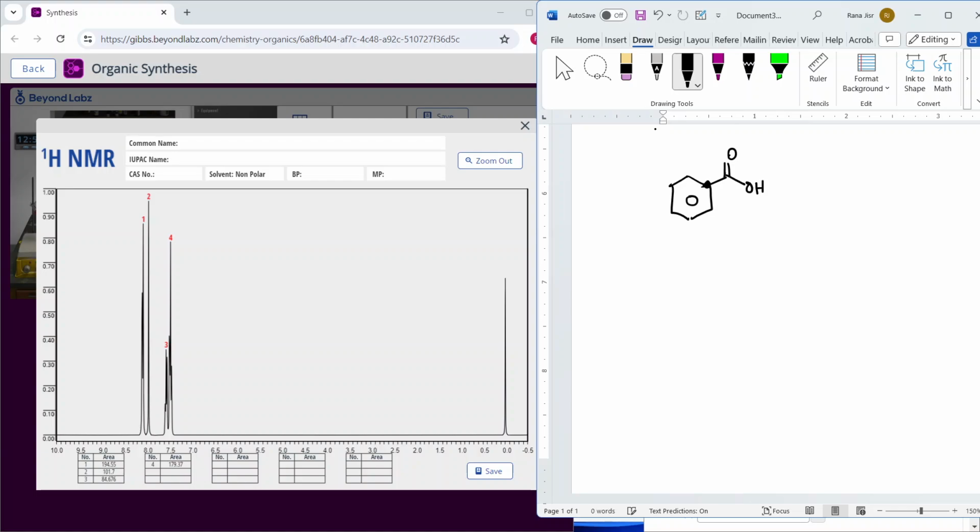And I know if I look at the structure in there, if I want to analyze how many proton NMR signals I have, these are the signals. Every different hydrogen will show a signal in the proton NMR. So these two hydrogens are the same. I do have proton A prime. So I'm going to see a signal for these two, just one signal, but that signal is going to correspond to two hydrogens.